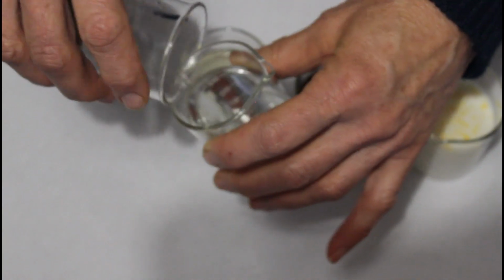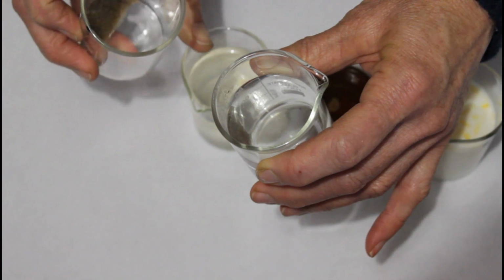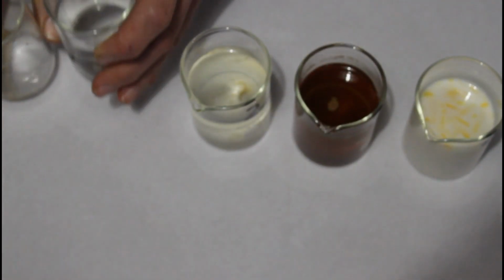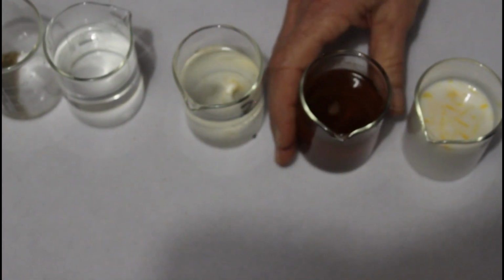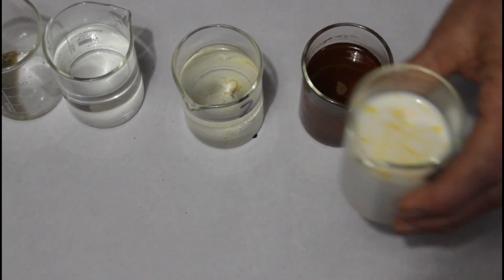So there we are. We've got the sand in there. I don't know if you can see that nicely in the camera. And there is the water. So we could do the same with the chalk. We could probably do the same with the curry powder. But we won't be able to do this with the milk.